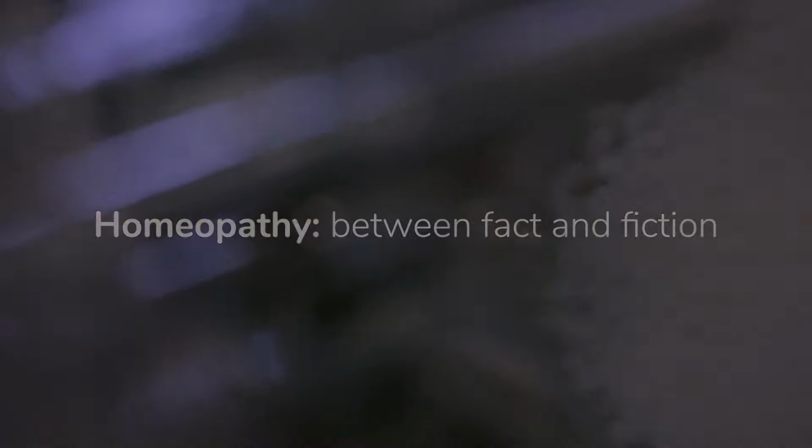Homeopathy is a system of medicine rooted in tradition with unique manufacturing procedures. However, with all the technological advances, how are homeopathic medicines made today? Our team investigates.